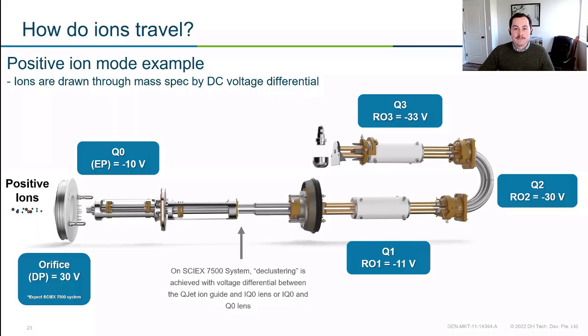So if we look at a little schematic of how that's working, here we have our positive ions moving through our triple quad. We've got our Q1 acting as the first mass filter. These are all ionized using ESI, and they're being pulled through our first quadrupole. If we told the quadrupole to focus and filter out anything that's not 500 m/z, everything else would fall out, and then it would be introduced into Q2.